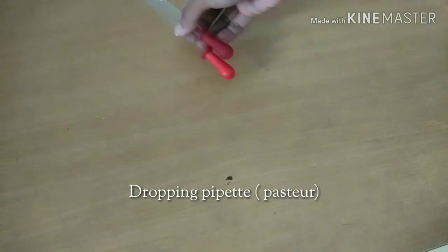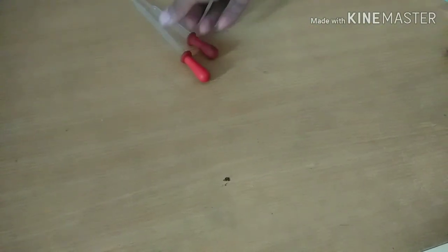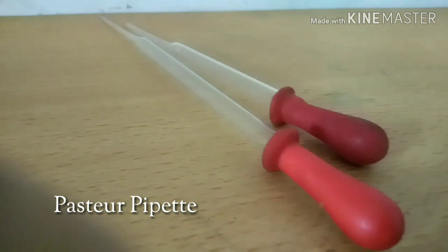One, dropping pipette or pasteur pipette are used to transfer small quantities of liquids.